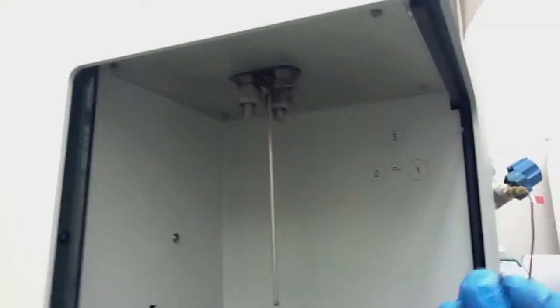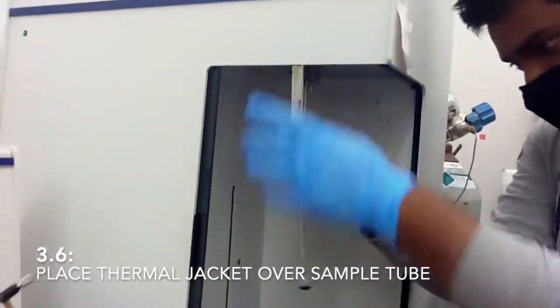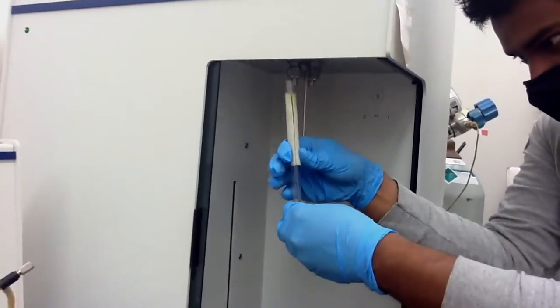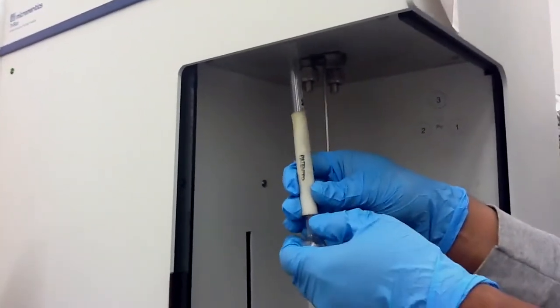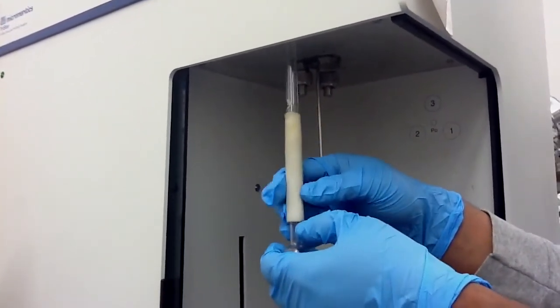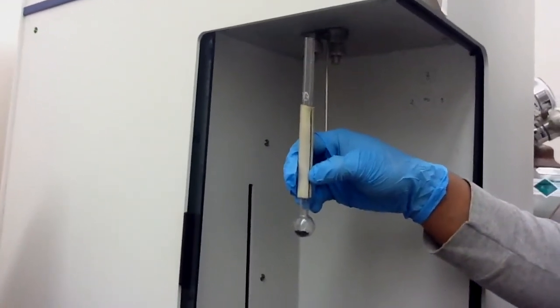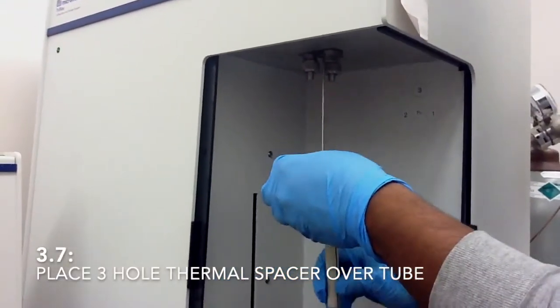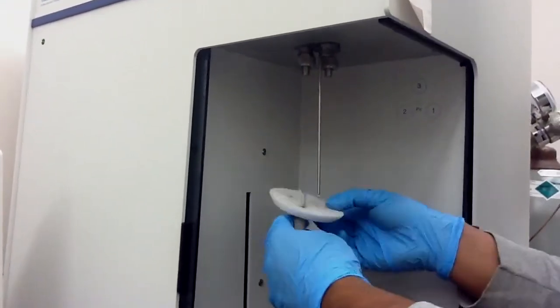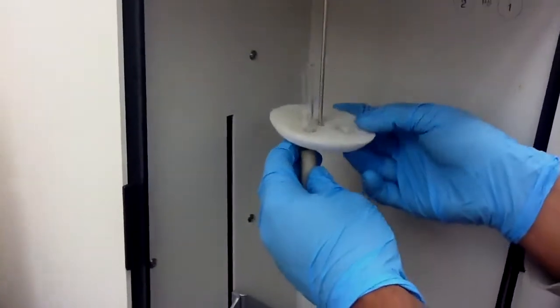You also need to take this ring out. Put a thermal jacket inside of it, and this will go all the way down till this red signal. Then you need to put this port here and put this rod inside in the middle.